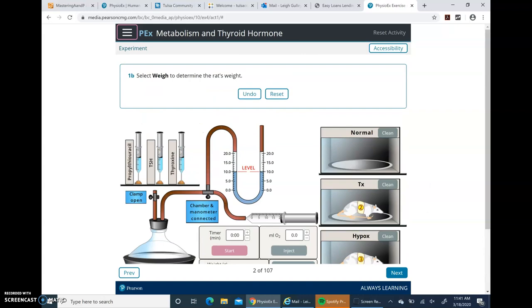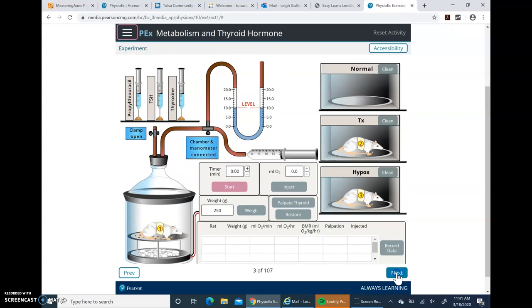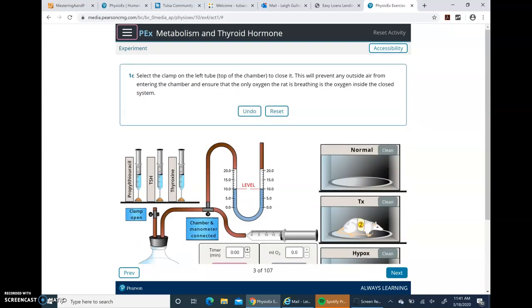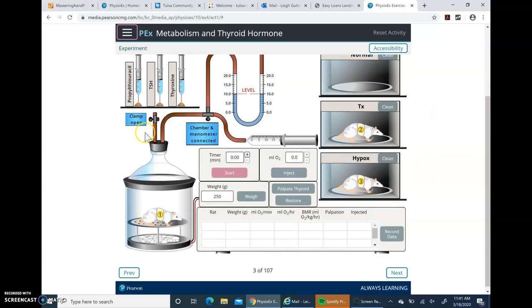Go back up and read the next set of instructions. It says select Weight to determine the rat's weight. We come down here, go to Weigh, and click it. That little rat weighs 250 grams. Then you click Next — it's in the bottom right-hand part of your screen. Then read the next set: select the clamp on the left tube at the top of the chamber to close it, which will prevent outside air from entering so we can measure the oxygen the rat is breathing. Click that clamp — it now says the clamp is closed. Then hit Next.